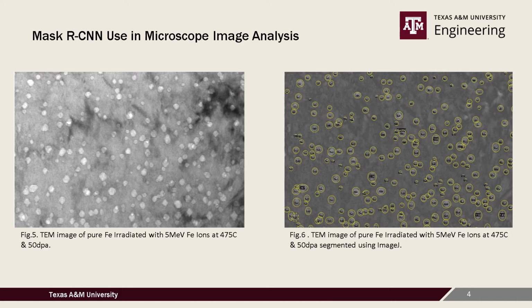With this method, each defect is individually segmented by the user, which can take hours upon days to complete. For this reason, it is very prone to human and calculation errors. The goal of this project is to develop a machine learning model that can autonomously label and segment irradiation-induced defects in microscope images, as well as performing relevant calculations such as void fraction per unit depth.